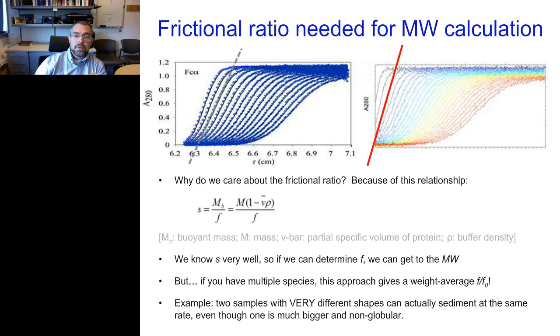If we look at the slope now of the boundaries with this highly elongated protein, and then I'm going to, for comparison, illustrate the gray slope here. That is exactly what I showed you on the left-hand side. You can see that there's a very distinct difference in the slope of these boundaries from our more globular protein, Fc alpha, and our less globular or highly elongated protein over here, the biofilm protein from the protein AAP.